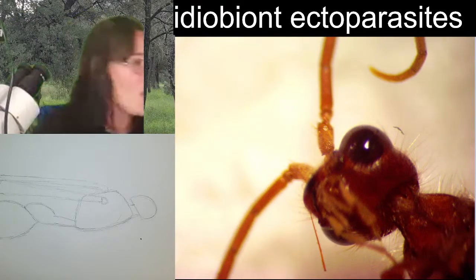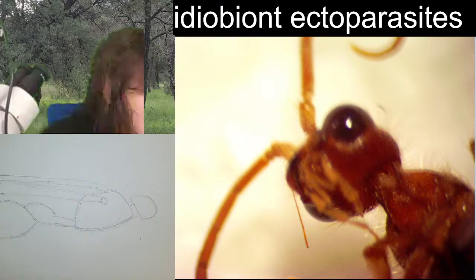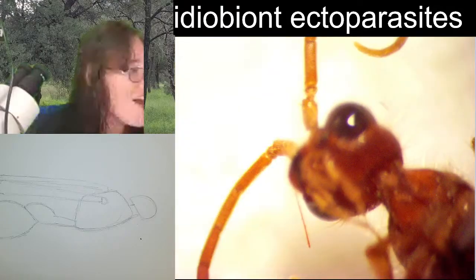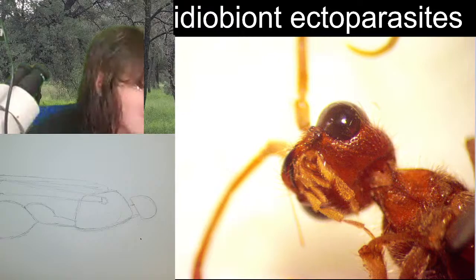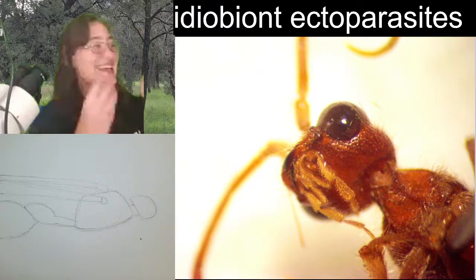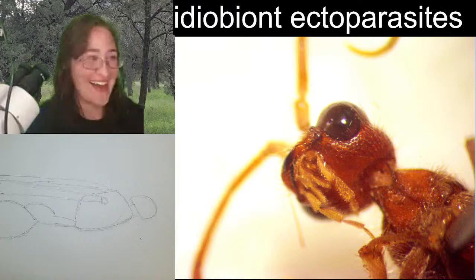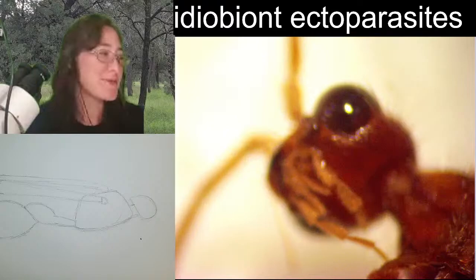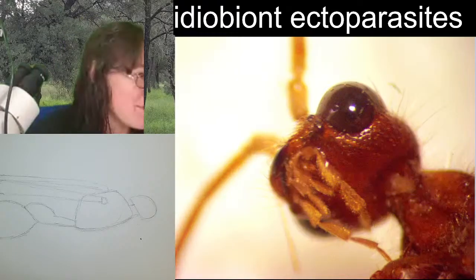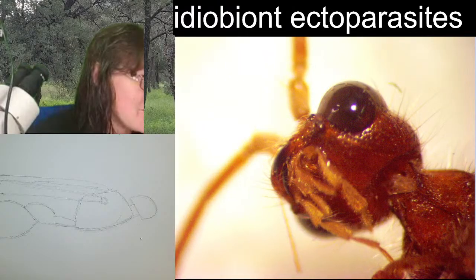Okay, this friend here has the longest palps I've seen on a velvet ant. Look at that, he looks like he has a mustache. His palps make me really, really happy. So this is his mouth. I'm only a little bit confused.